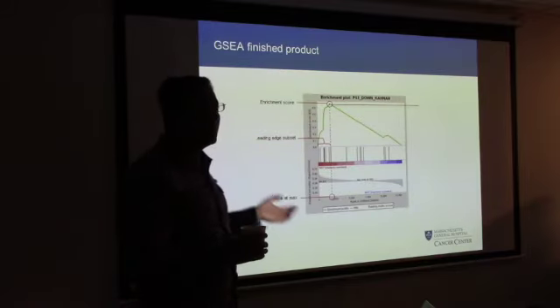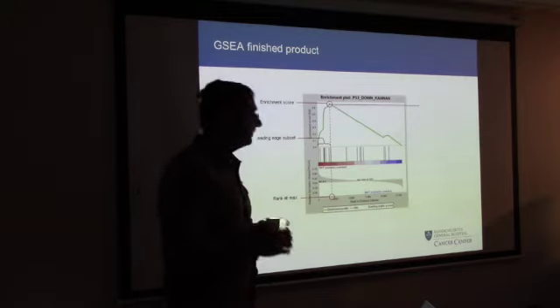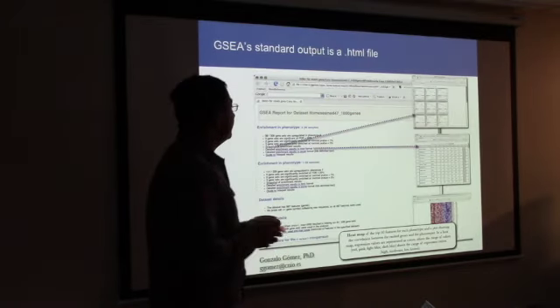So it's fairly straightforward. Questions so far? Okay. All right, so let's look at the output.